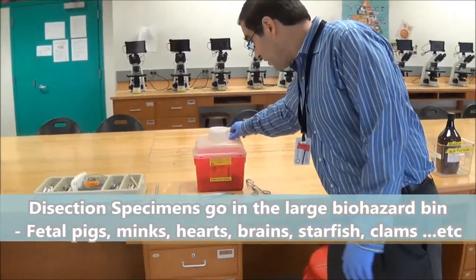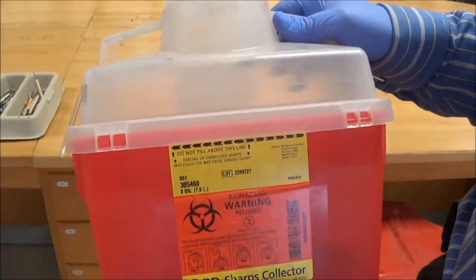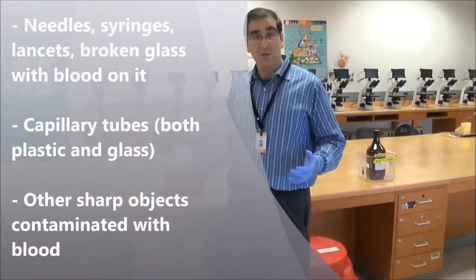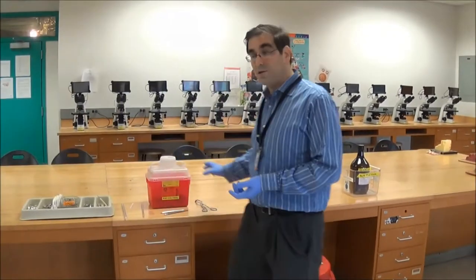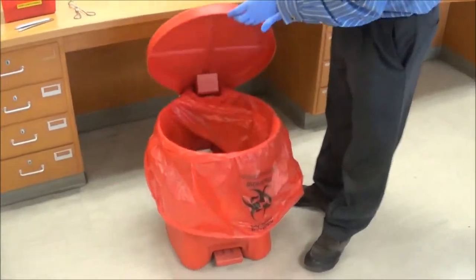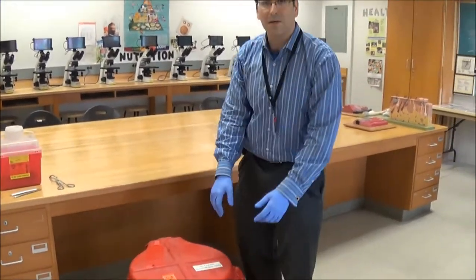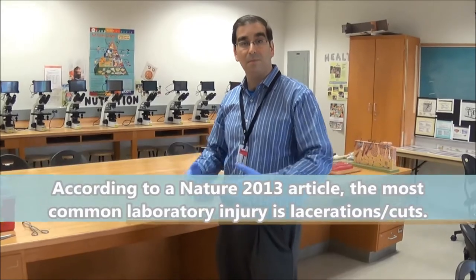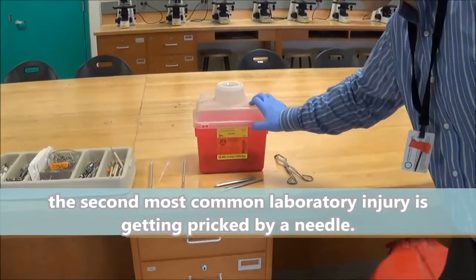The other type of biohazard container is specifically marked as a sharps collection container as well as biohazard. Anything that is sharp — a needle, for instance — you would want to put in here. The reason is when this container is collected, there's a bag we pull out of it, and any sharp biohazard item would pierce that bag. Not only would things potentially fall out or leak, but somebody could hurt themselves considerably if a sharp item poked them through the bag. That's why those items are specifically collected in the sharps container.